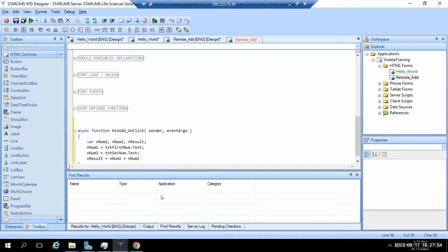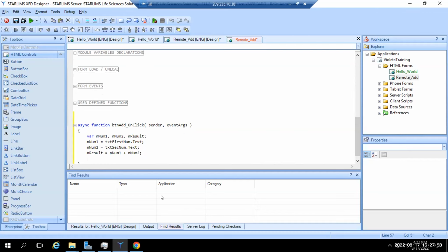Okay. And then semicolon. And now we need to, the same way we set dot text over here for the result, we need to say assign this value, do the assignment to this variable here, in another line. Yeah, exactly. So let's bring up the same way we're doing here. Let's bring up the result text.